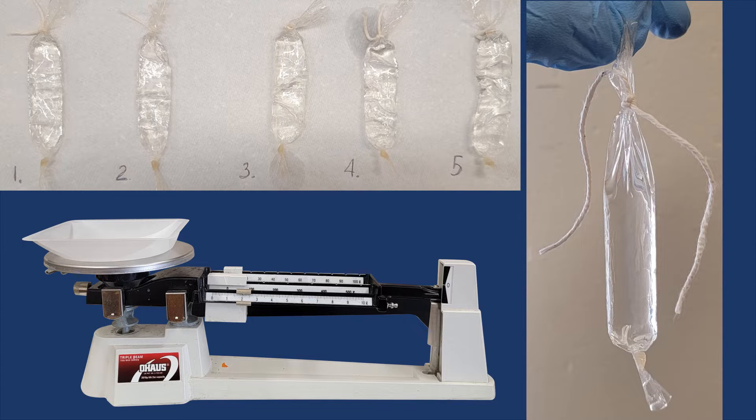In this experiment, we will explore the principles of osmosis by using dialysis bags as model cells. Dialysis bags are made of semi-permeable membrane that allows water molecules to pass through while restricting the movement of large solute molecules such as sucrose. By placing dialysis bags filled with different solutions into beakers containing various sucrose solutions, we can observe and measure the direction and extent of water movement due to osmosis.